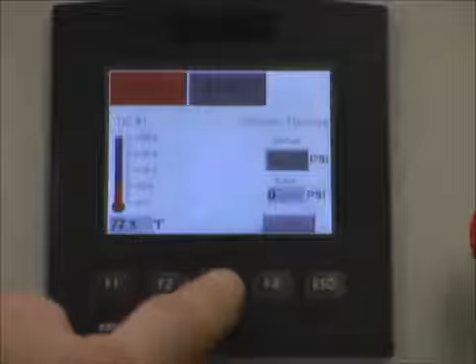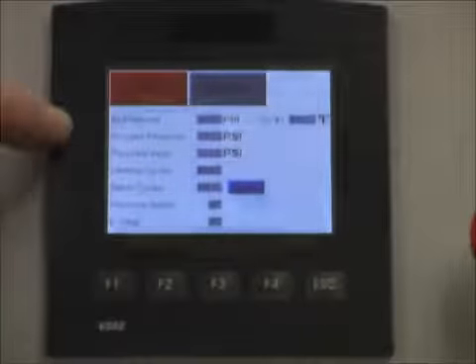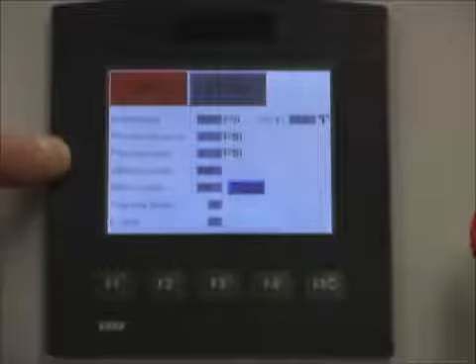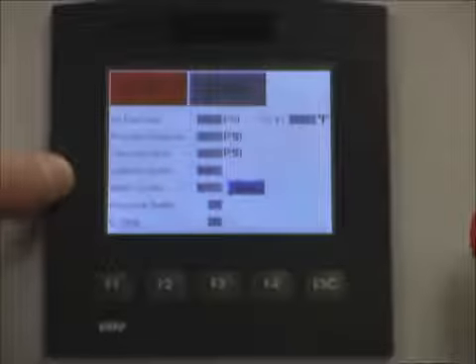Onto the F3 screen. This screen again has the on-off controls on the top, and a general overview of what is happening in the PLC. A couple of the inputs and outputs are shown, as well as a batch cycle counter. There's also lifetime cycles for every stroke, and the batch cycle is resettable. So we can hit the blue reset button and that will return to 0.